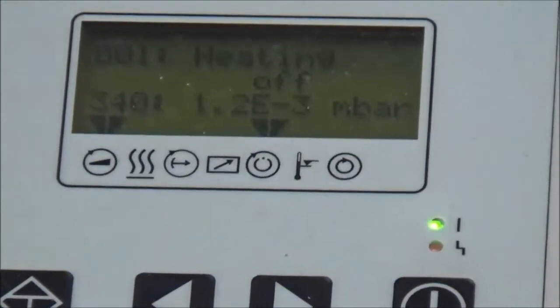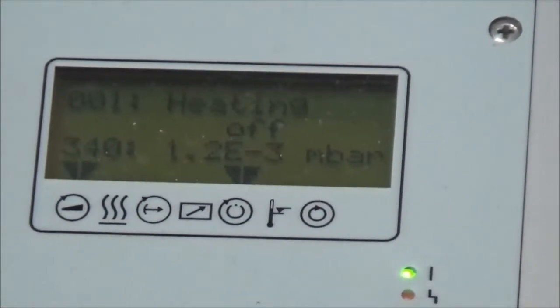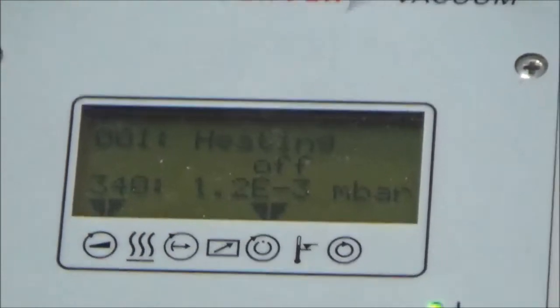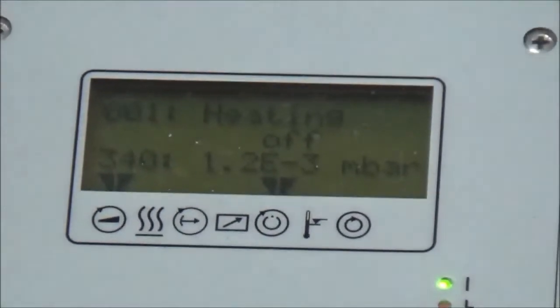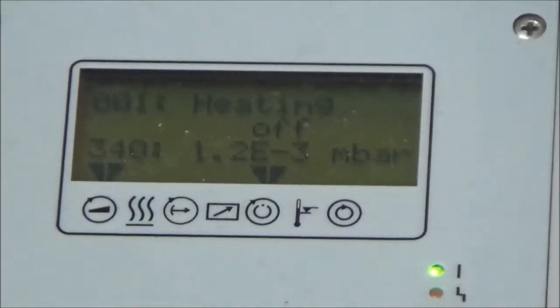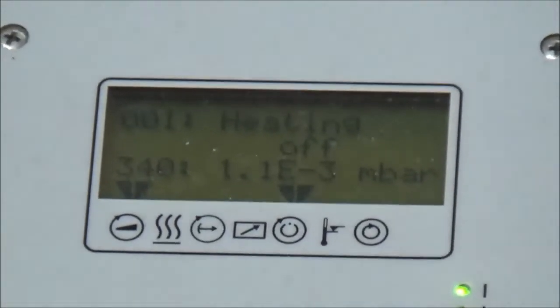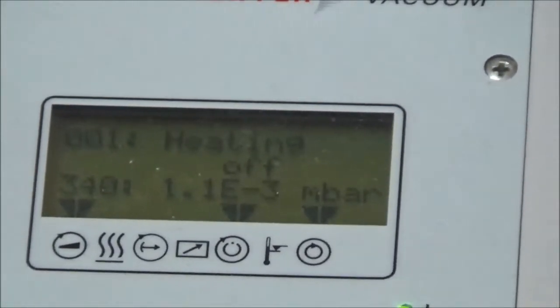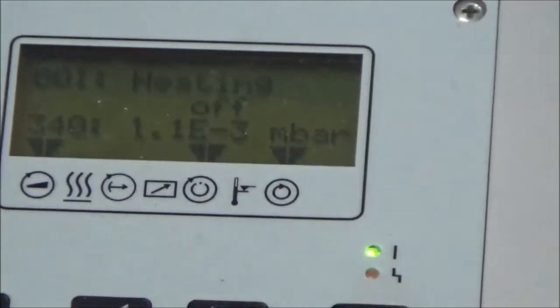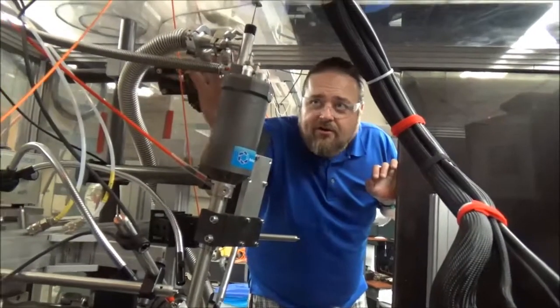In just a second, we're going to basically hit the bottom of the charts, as it were, for this particular vacuum gauge. And we know that we've achieved basically the lowest pressure that we can record with this particular vacuum. Okay. So we know that this is all under vacuum now.